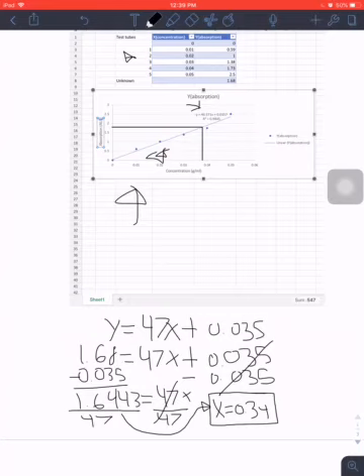Everything kind of has to come together in this too. You have to have other data of other Kool-Aid concentration and absorption values. You can't just go with one unknown value, because then you can't compare it to other known values to estimate a concentration. It's really helpful to use a standard curve, which is a graph, and the best fit line to get a fast estimate, and then the linear regression for when you're ready to get the real estimate and compare it with the easier one.